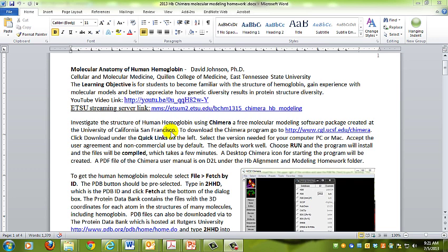It has a nice function where it pulls up the molecule and goes out and gets the PDB files. Those PDB files are the star coordinates for where the atoms in a 3D structure are located. The software connects those into bonds so you can see the actual structures of amino acids, compounds like heme, and even DNA and RNA.